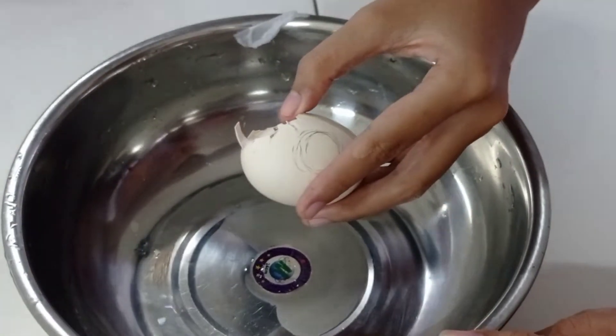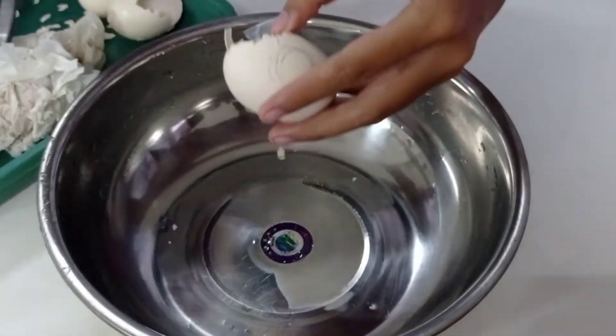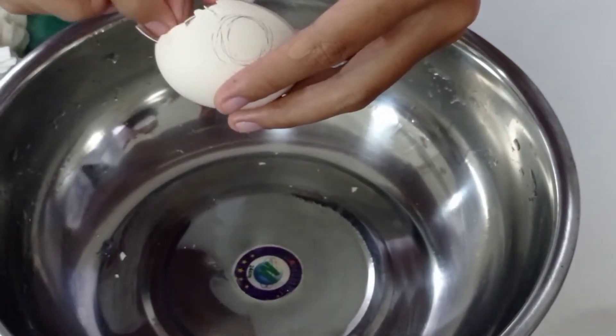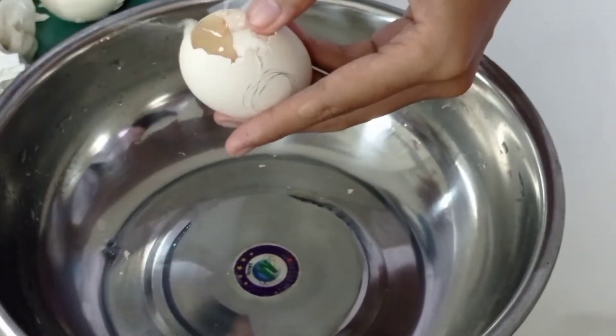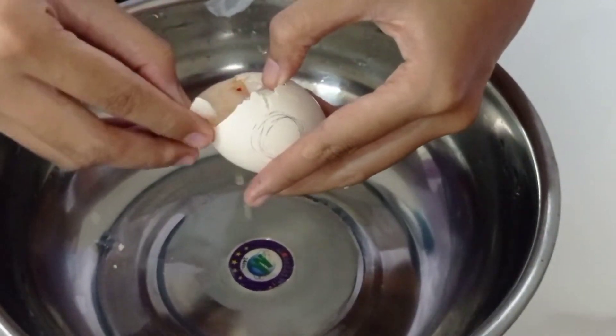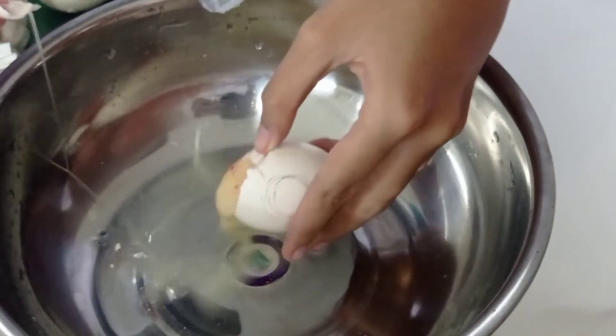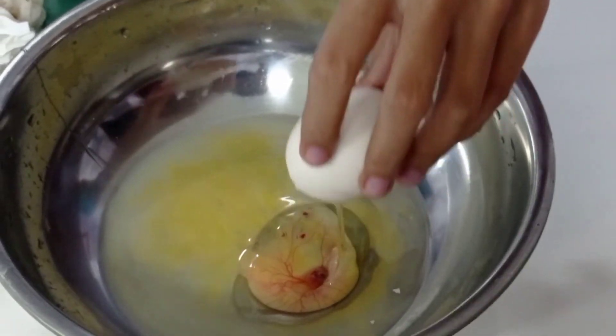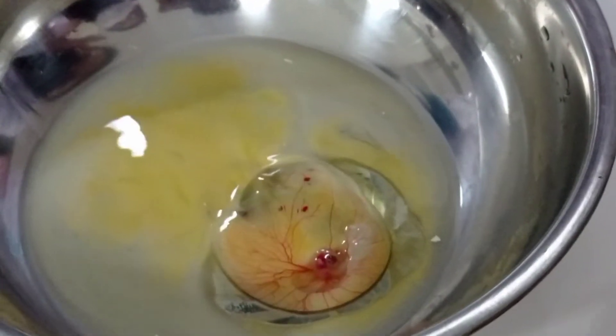Lalu ada cara lain, yaitu dengan mengupas secara perlahan-lahan menggunakan pinset dimulai dari bagian atas telur atau rongga udara pada telur. Dikupas perlahan hingga tiga per empat bagian telur, kemudian dituangkan ke dalam baskom.